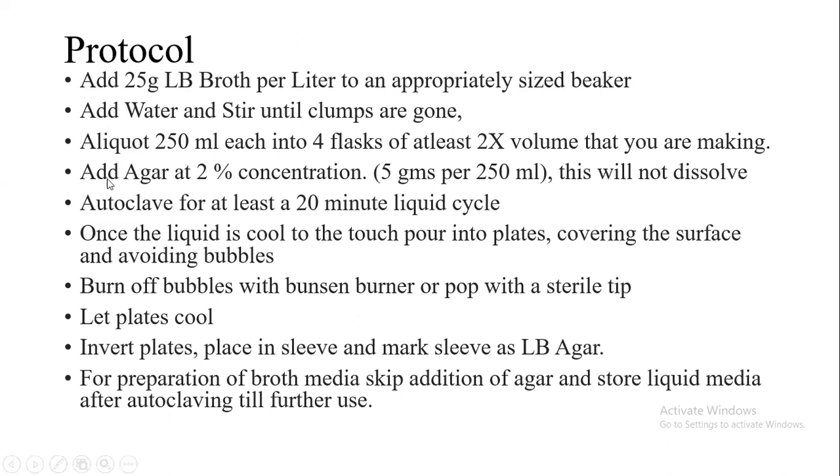Then we will add agar agar at 2% concentration, which means about 5g is required for 250ml of LB agar media that we are preparing. We will then autoclave it after adding agar agar to the LB broth.